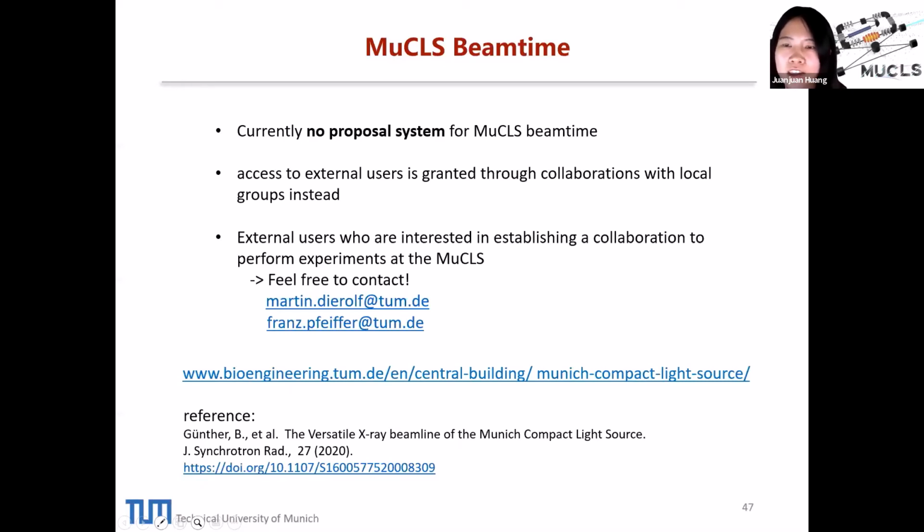Other than that, I haven't really tried to see how the statistics differ with different sample concentrations. So far, I only tried measuring samples with optimum transmission signal.